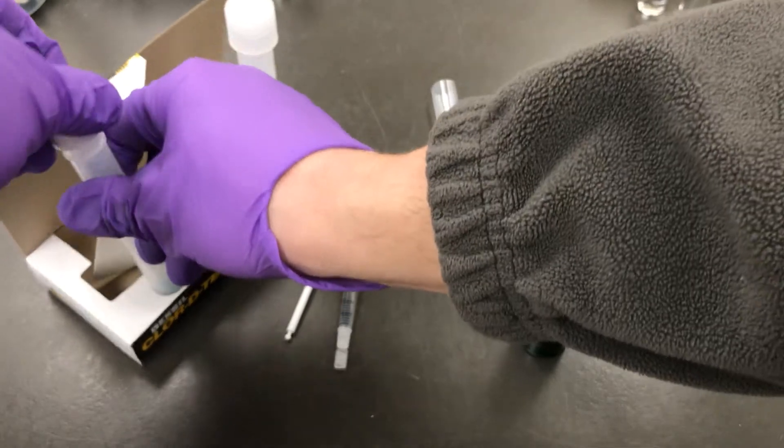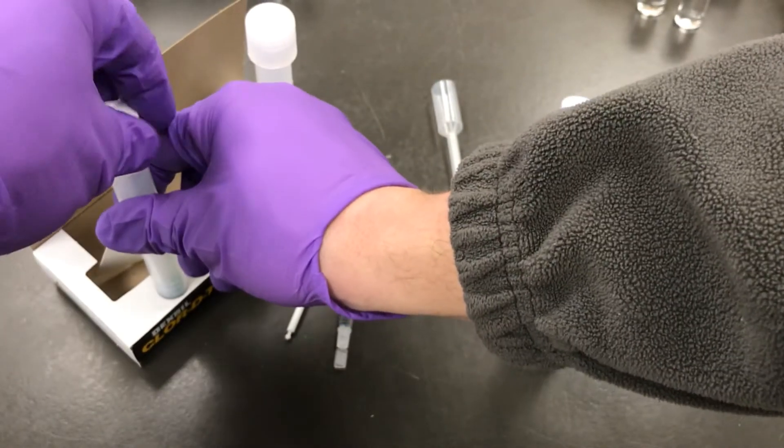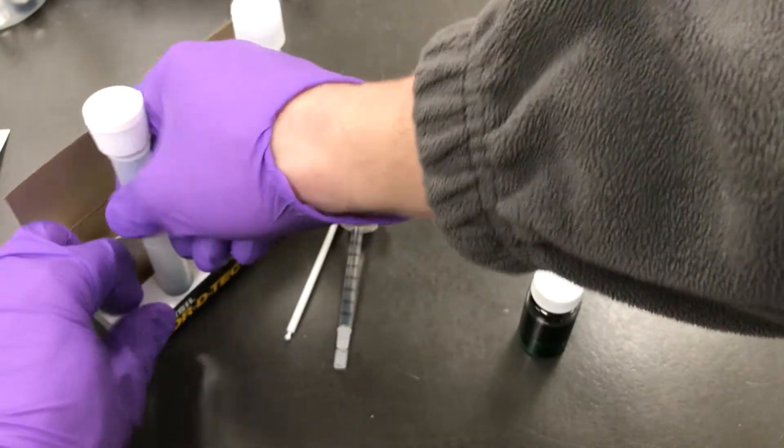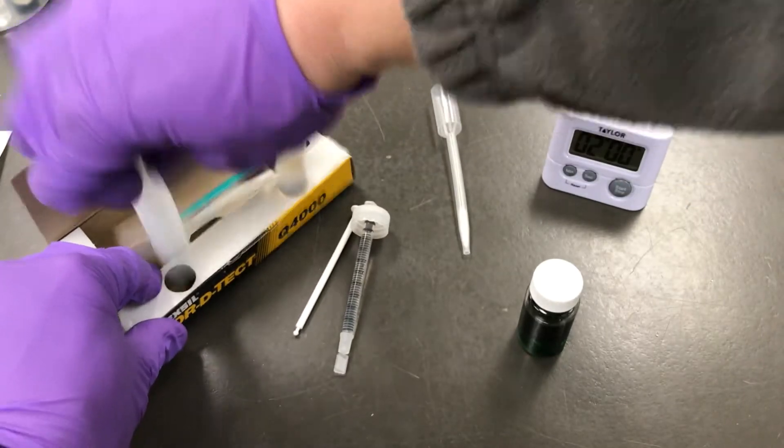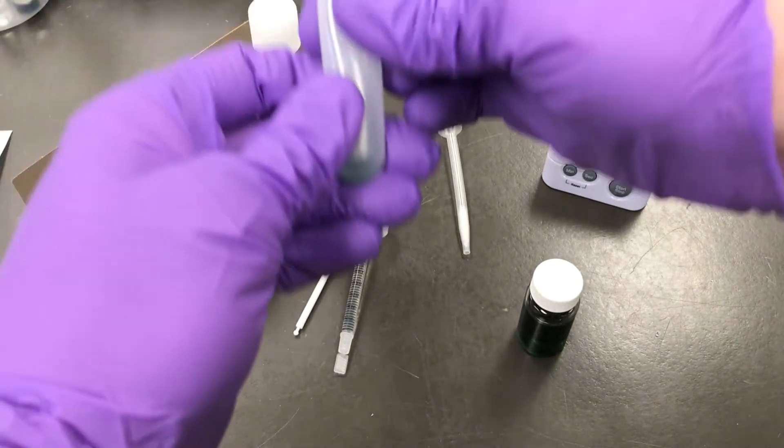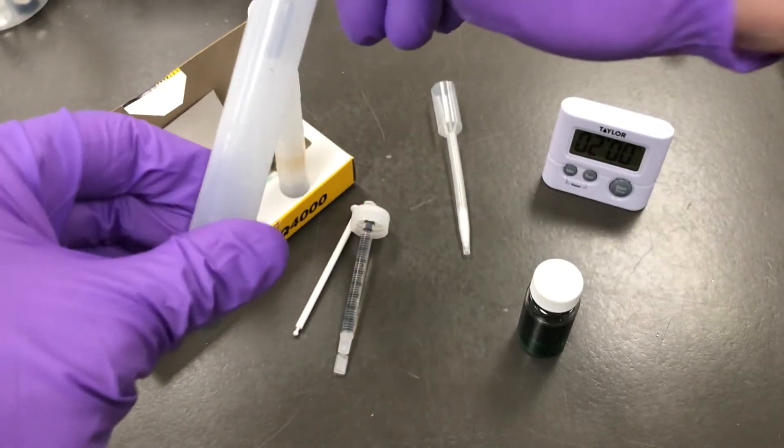Wipe off any excess oil and dispense the oil into test tube one. Replace the cap on test tube one. Squeeze the sides of the test tube to break the bottom colorless ampule and shake it for 30 seconds.